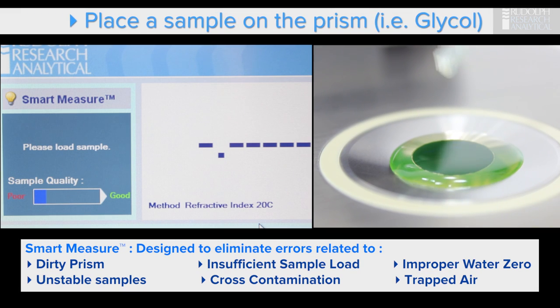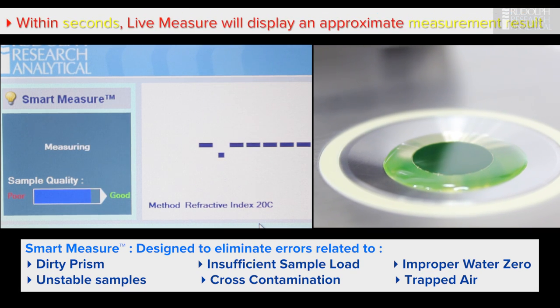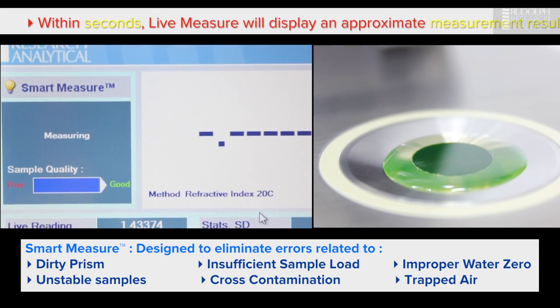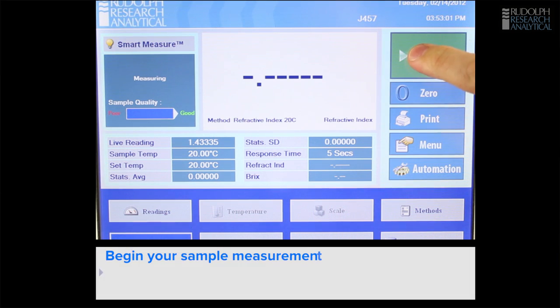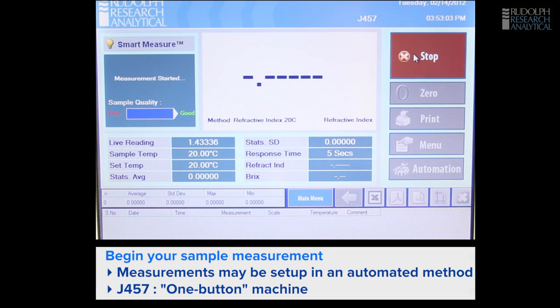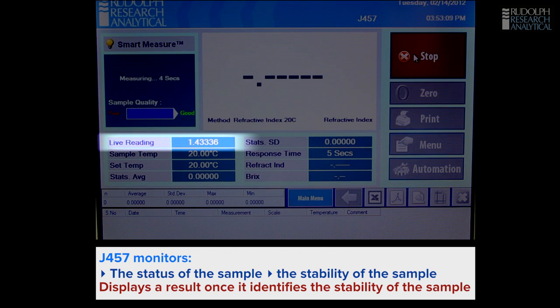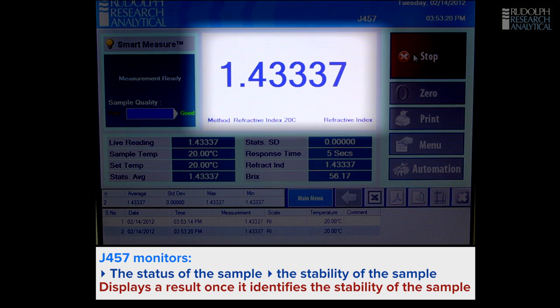We place the sample on the prism. You'll see the sample quality indicator goes across the screen and the instrument almost instantly responds to the sample, giving an approximate result very quickly, which then locks into a finished result. We can start the reading whenever we want. We can even have the instrument start the reading automatically if we choose. The system will then monitor the status and stability of the sample, and when it decides it's stable, display the result in the window.